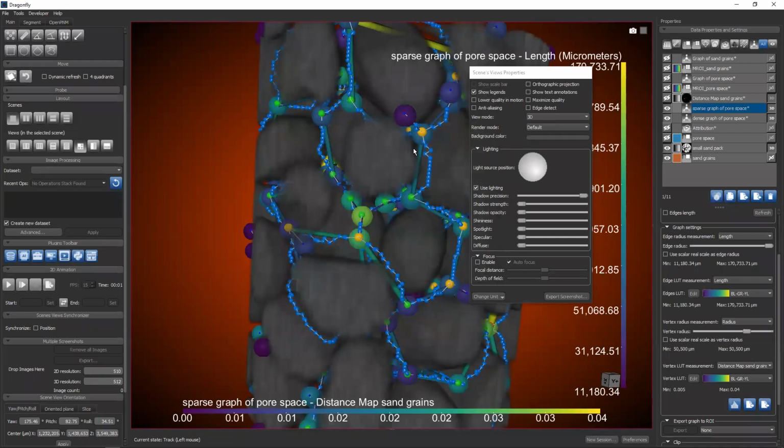All right, I think we've got time for maybe one more question. Can you repeat an application for graphs like these? Well, I'm not really sure what that question means because there's no picture in the question. So we'll take one more question. Interested in creating an ROI like you used today. Will you cover this tomorrow? Sure. We'll take this data set and we'll show you how to create these particular ROIs. Then you'll know how to go from a data set like this to this kind of ROI, and then of course to the graph, since we saw that today.